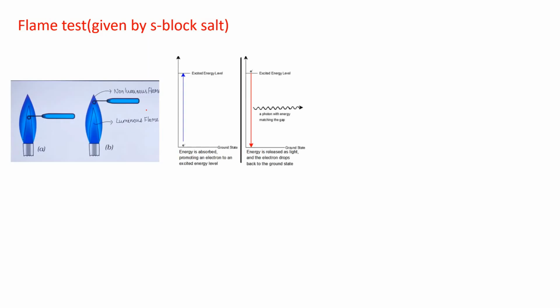Now we'll see the reason for this flame test. Before that, let me tell you, this flame test is given by S block salts.